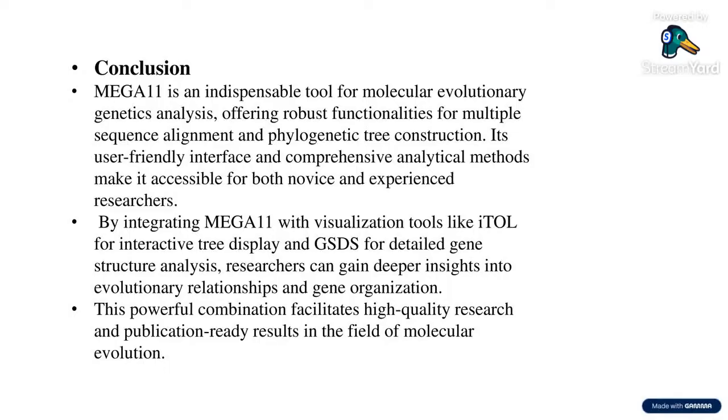Now if we talk about iTOL advantages, iTOL is integrative, has beautiful visualization, and supports rich annotation, pie charts, heat maps, or color labels, and also exports in high-resolution formats. That is best for our journal publication.